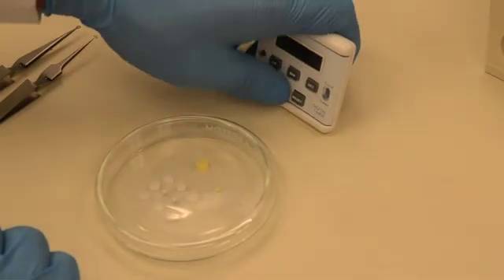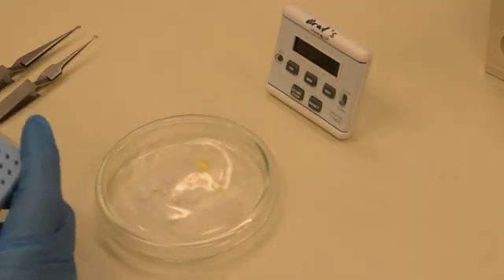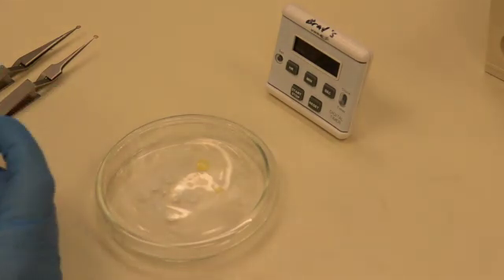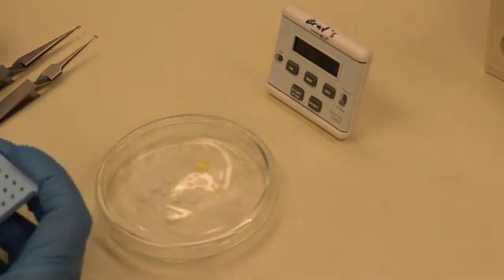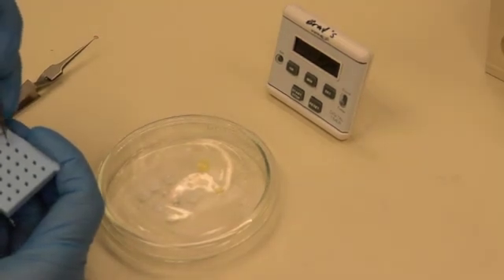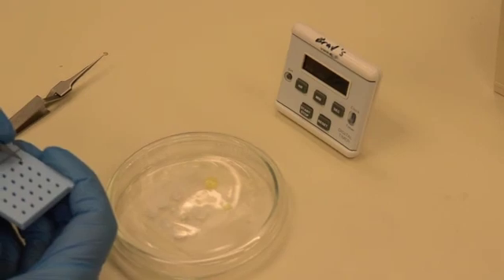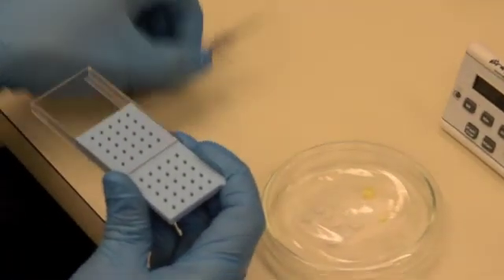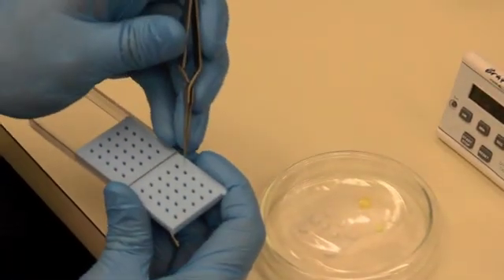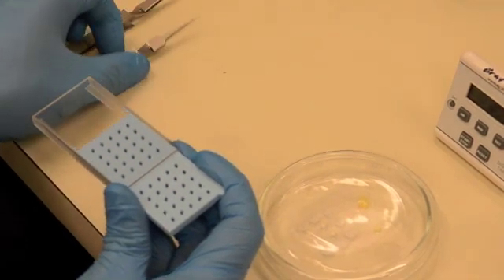Allow the grids to dry completely before storing them in a proper grid storage system. Record in your grid log which grids have been stained.